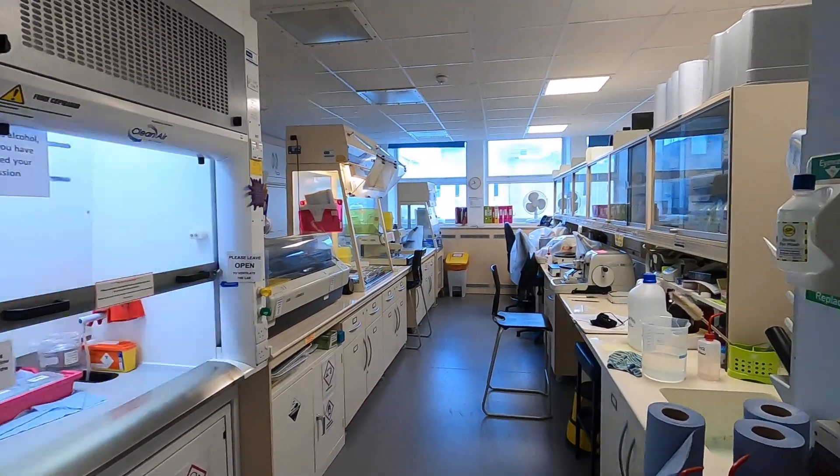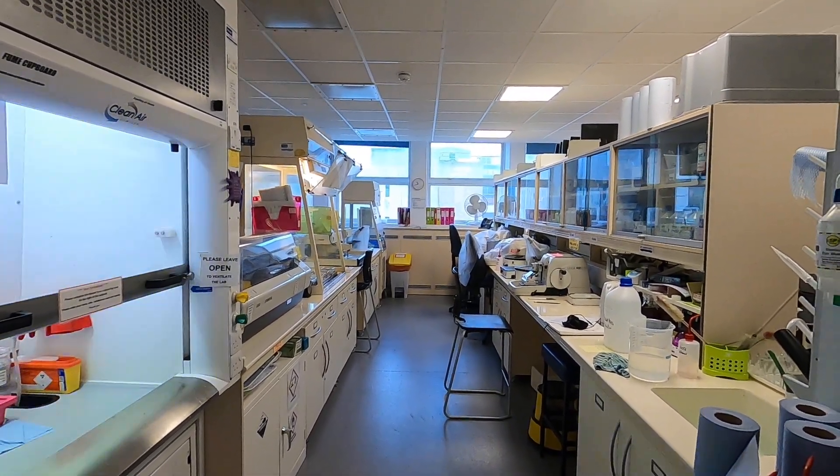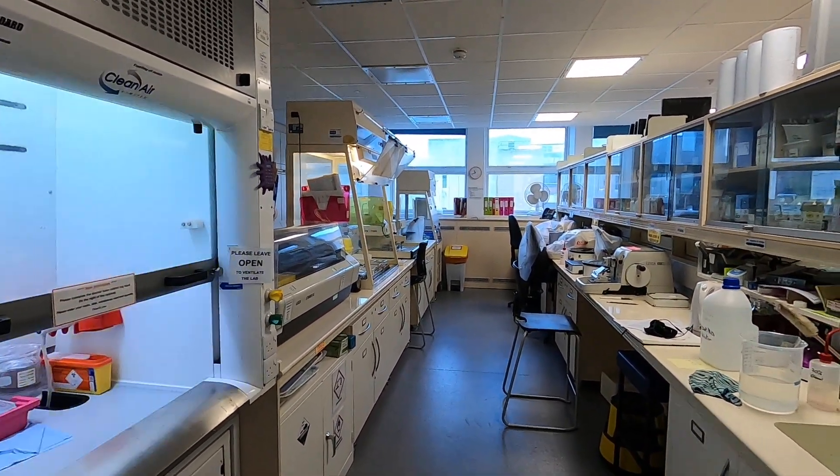Now the lab itself is pretty much reminiscent of a standard laboratory that you will encounter in any hospital or any research laboratory. All the equipment is generally the same kind of thing.